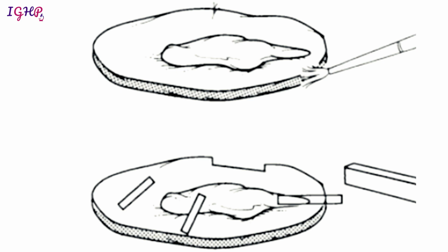So if you are getting an ellipse, or a wide local excision (WLE) specimen, make sure that you cover the area where the lesion is closest to the lateral margin, and then you cut it serially in whatever fashion you have cut, and you look at the area where the lesion is closest to the deep margin. Before you cut your specimen, it is wiser to ink the entire base of the specimen, so that the ink gets imbibed on the base, and when you take sections from the base, you can tell the distance of the lesion from the base.